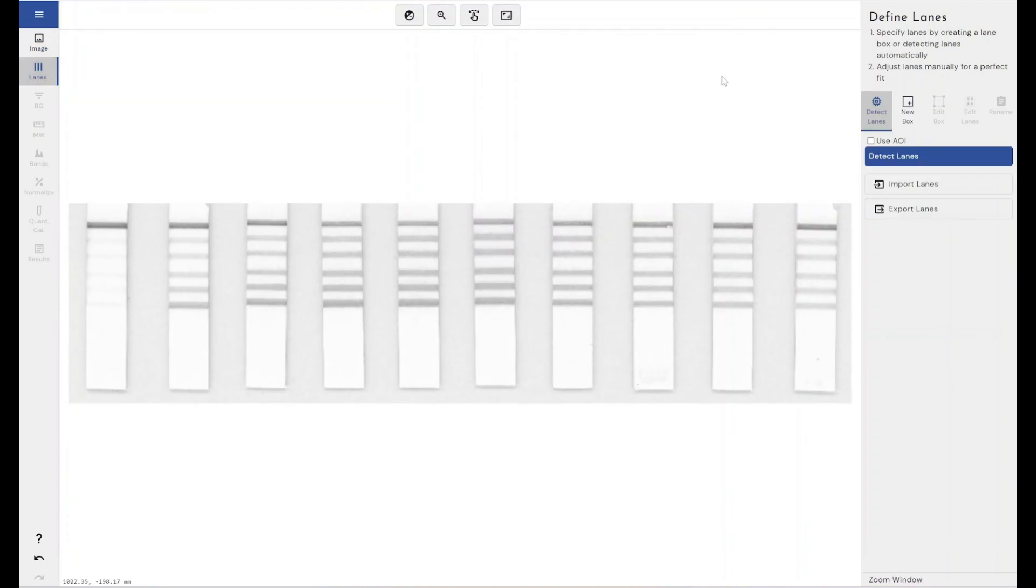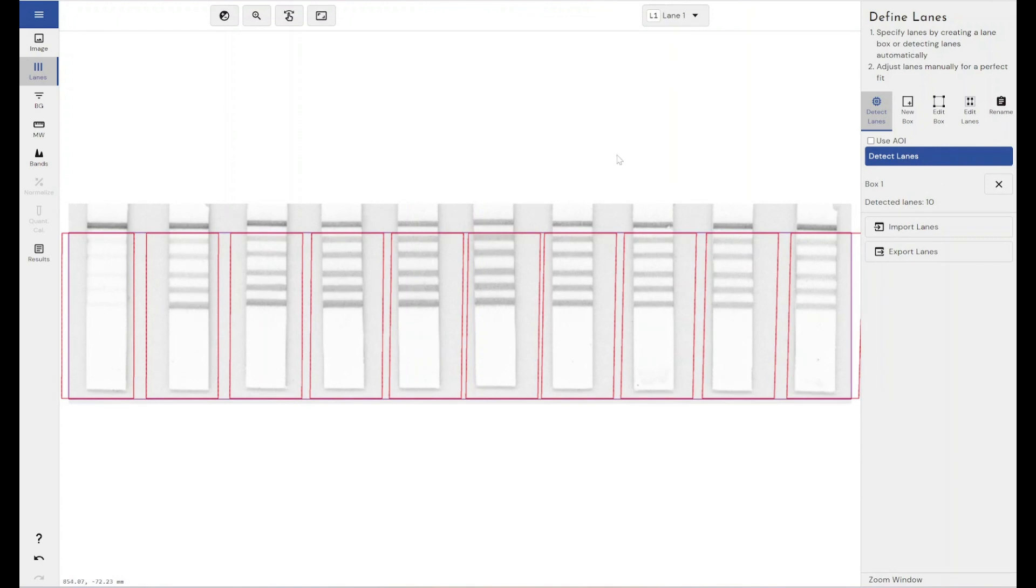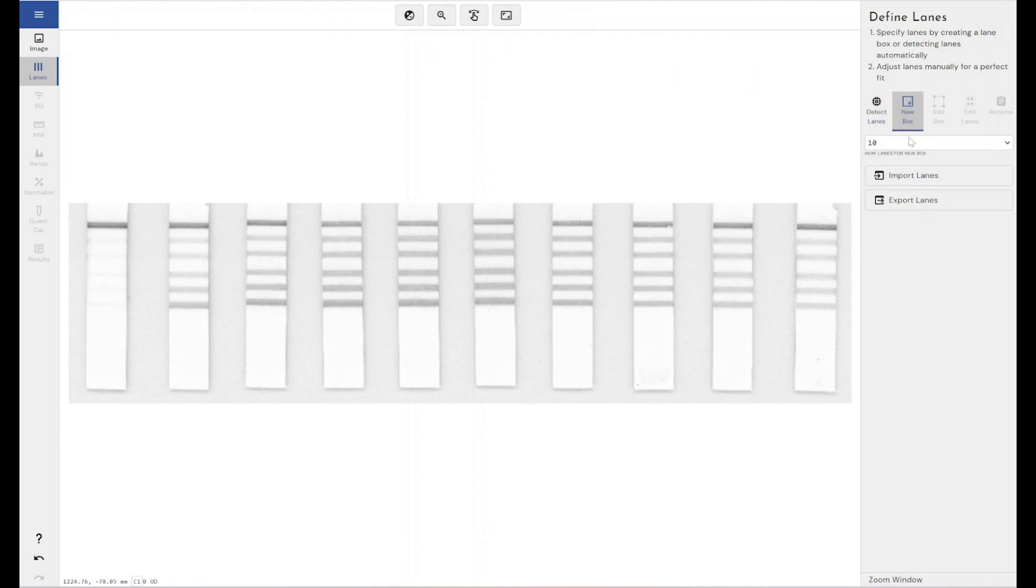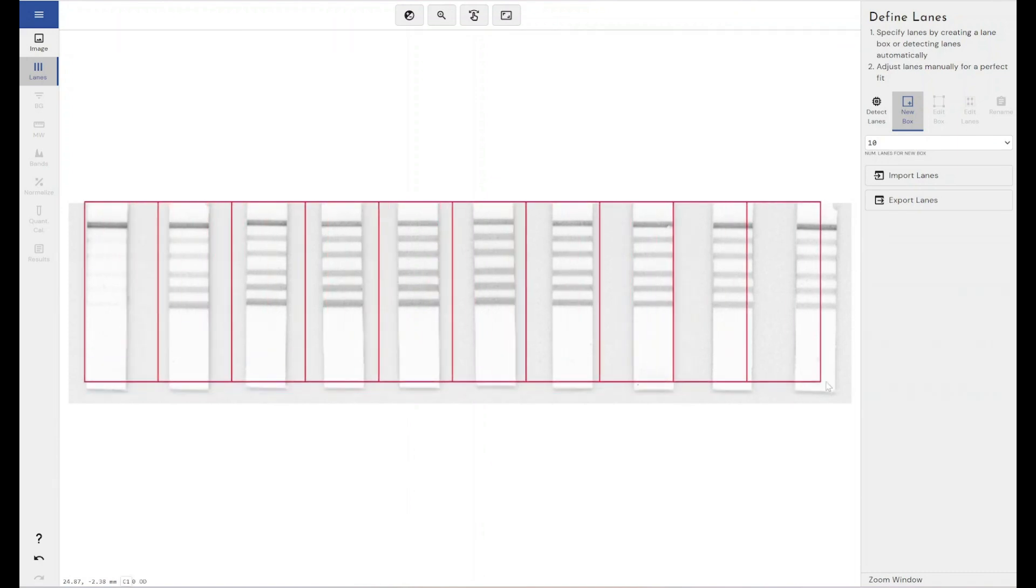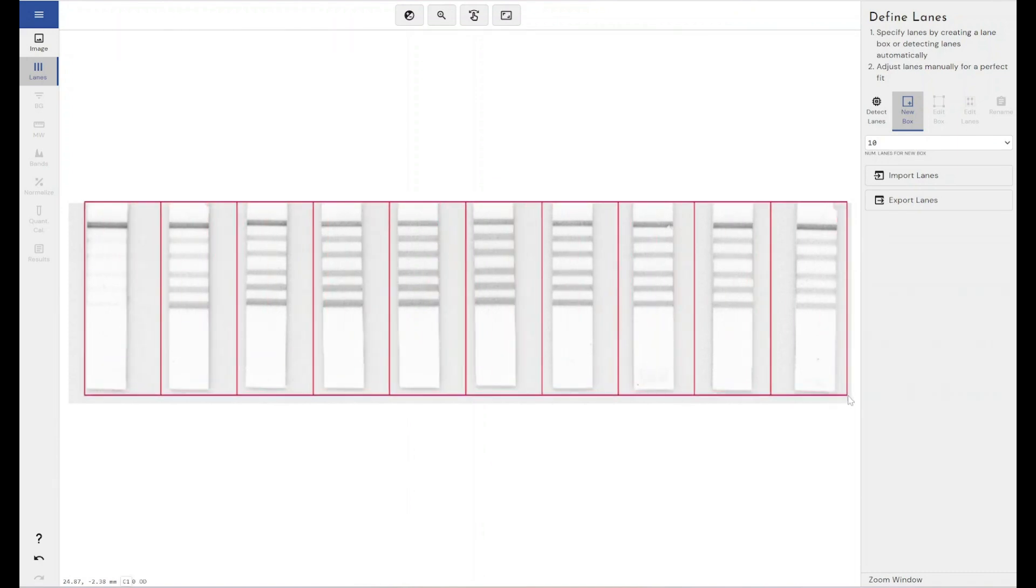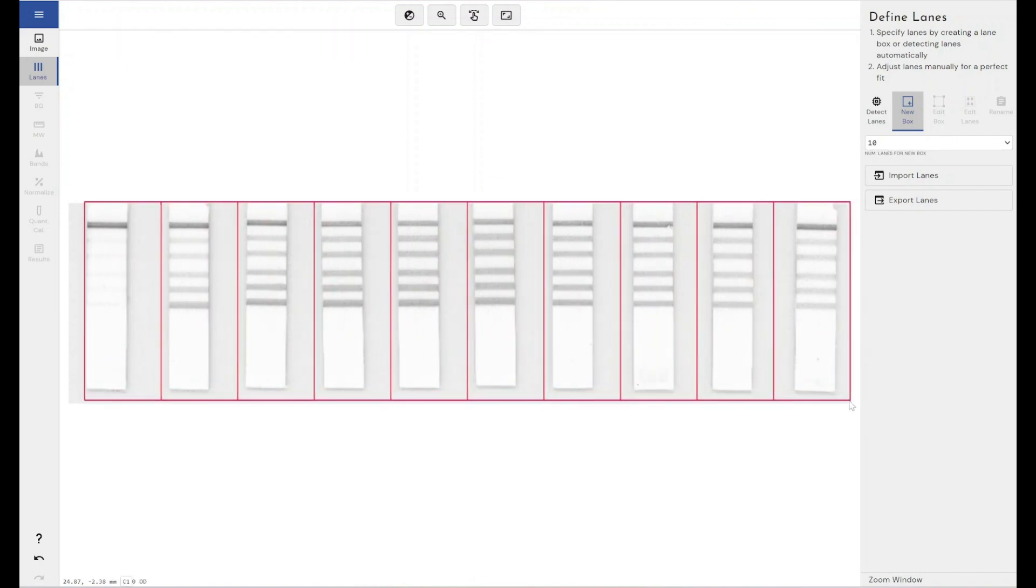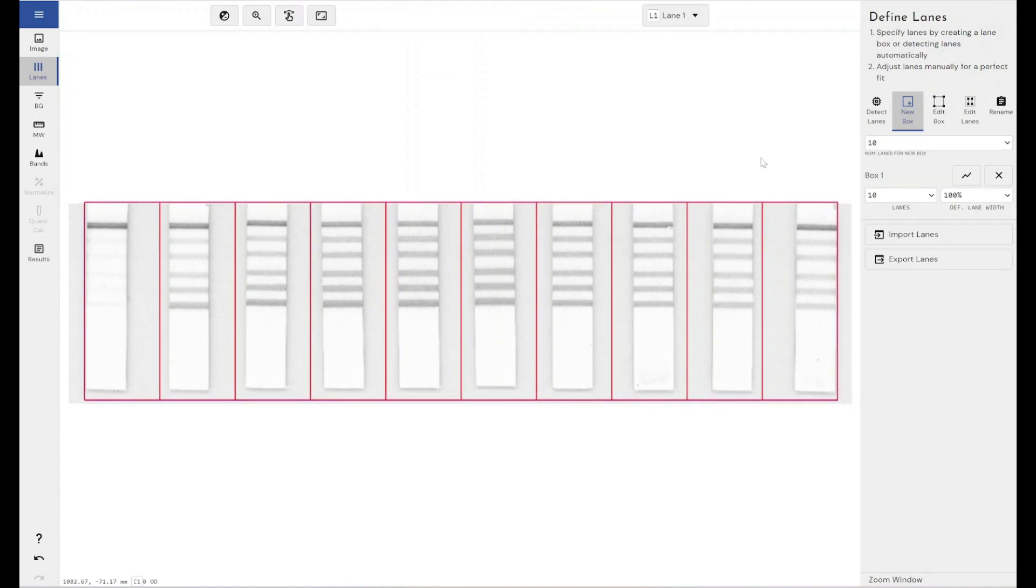I'm going to come through and create lanes. And again, this doesn't work. 1, 2, 3, 4, 5, 6, 7, 8, 9, 10. Ten lanes. So, I would define my lanes as usual.